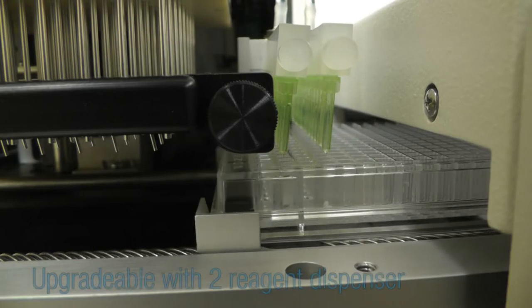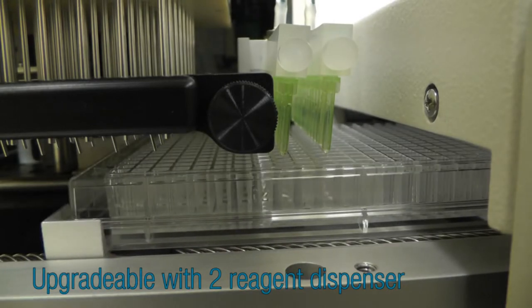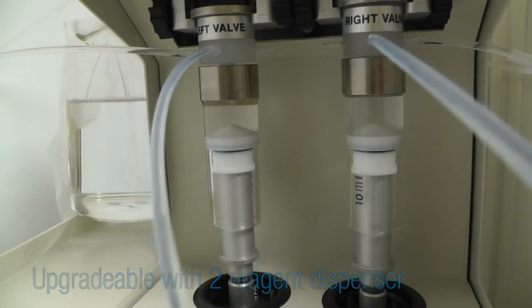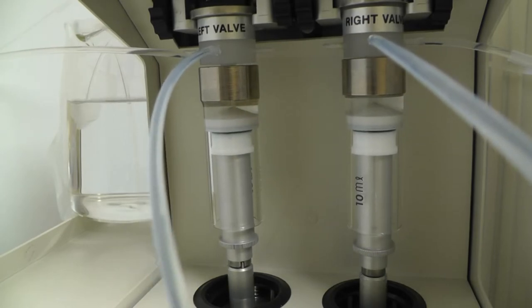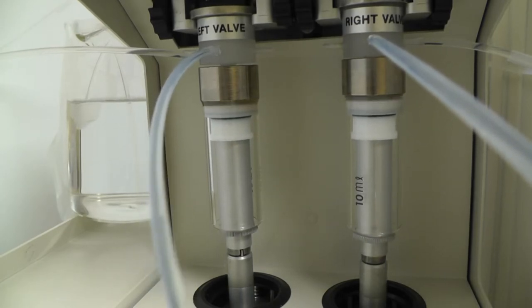The instrument is upgradable with a two-reagent dispense module. The user has the option of dispensing two different reagents or dispensing one reagent from both dispensers for increasing throughput.